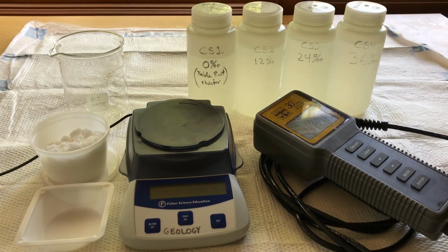This lab is all about salinity. There are a variety of methods that can be used to measure salinity. The most basic method is to measure the mass of a seawater sample, evaporate all of its water in an oven, and then measure the mass of what's left over as dissolved solids. We can use these data to solve for the mass-based definition of salinity. As you can imagine, this method is relatively slow and certainly not very easy to perform on a ship.